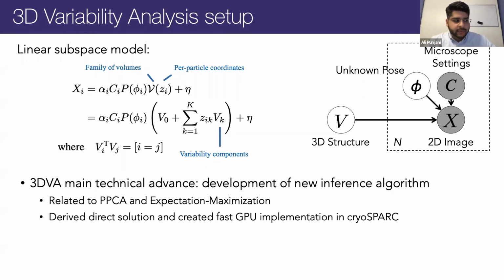What we were able to do is derive a direct solution for that inference algorithm and create a fast GPU implementation of it, since it's a relatively heavy operation.